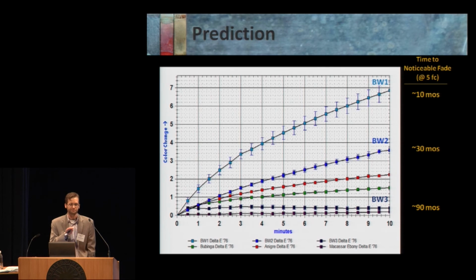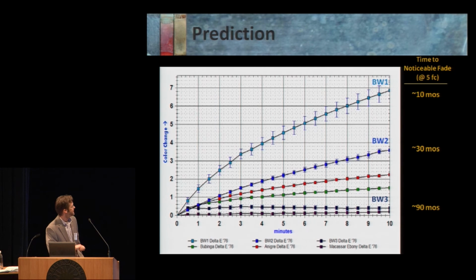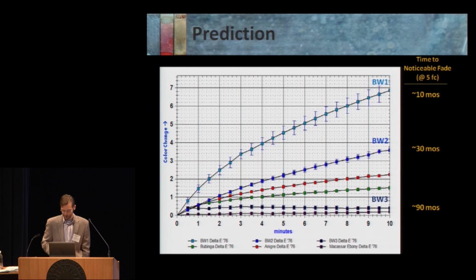Now we run a series of fast-fading standards that are the yardstick by which we can compare to the artwork or to the material under test. Blue wool 1, 2, and 3 fade at known rates. And so blue wool 1, for instance, will be noticeably discolored after a little less than a year at 5-foot candles. Blue wool 2, slightly slower. Blue wool 3, slower still.